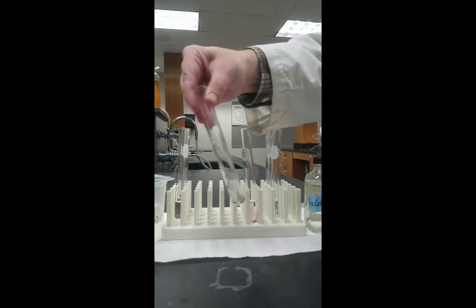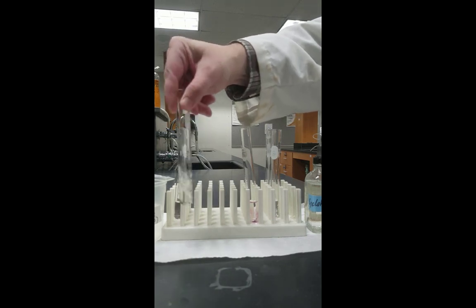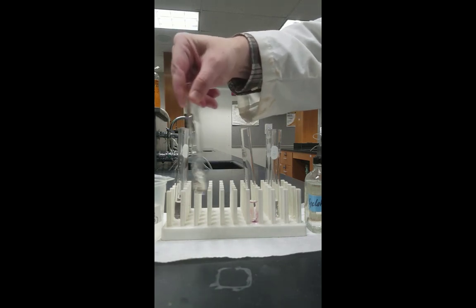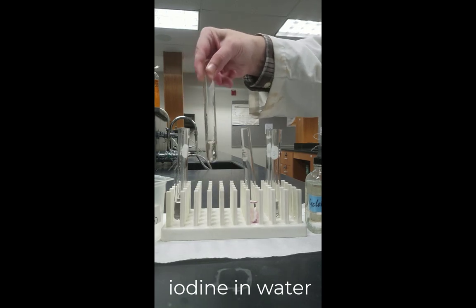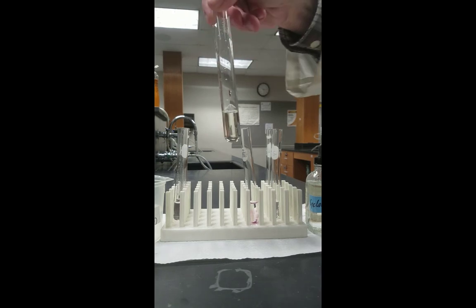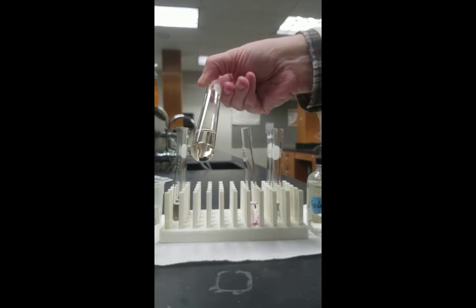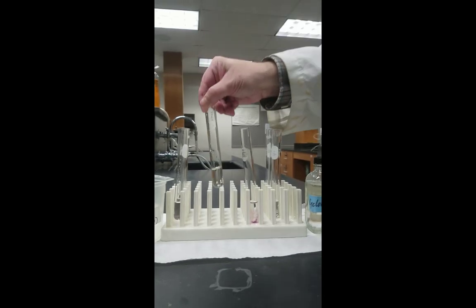Shaking the test tube on the left with iodine and water does produce a slight change. You'll notice if you look very, very carefully that the water is just slightly discolored, a little yellowish or brownish. But most of the solid remains at the bottom of the test tube.